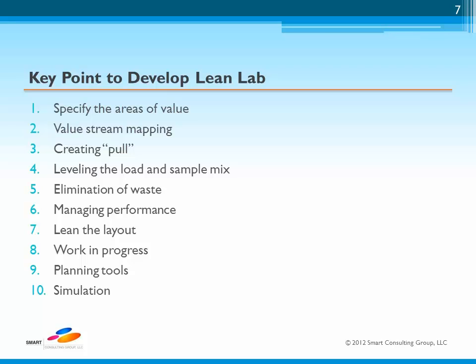Let's level the load in sample mix. We eliminate waste. We manage performance. We lean the layout of the laboratory function. We reduce work in progress. We operate using planning tools. And where necessary, we use simulation modeling to enhance our operation.